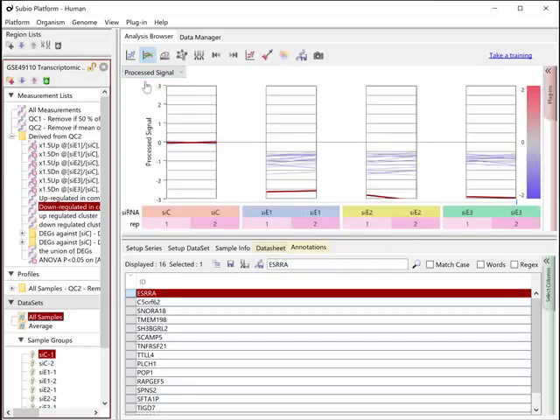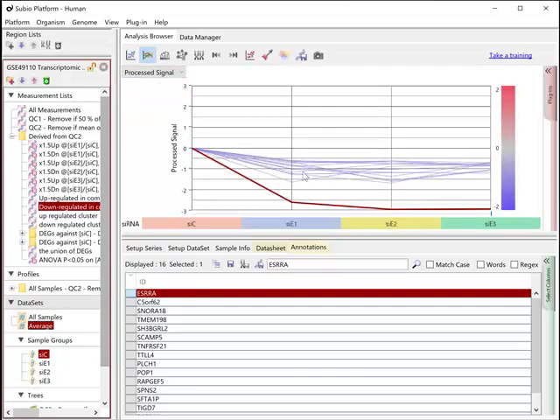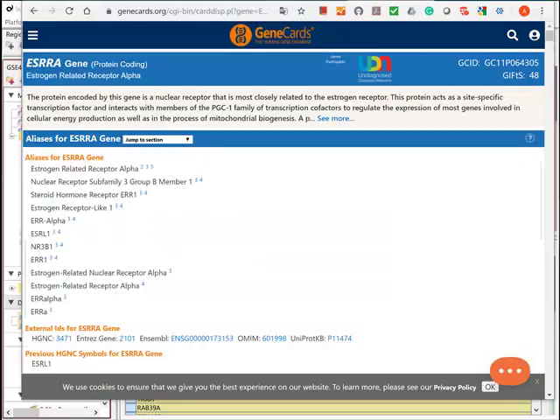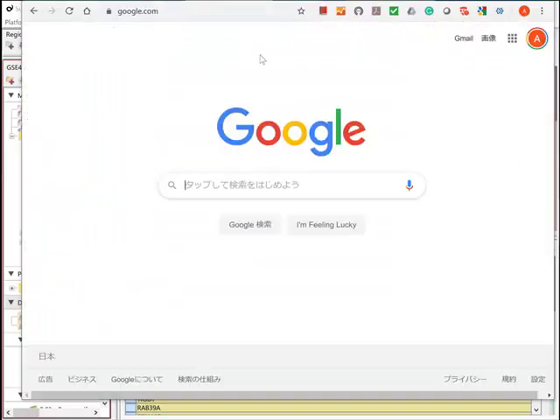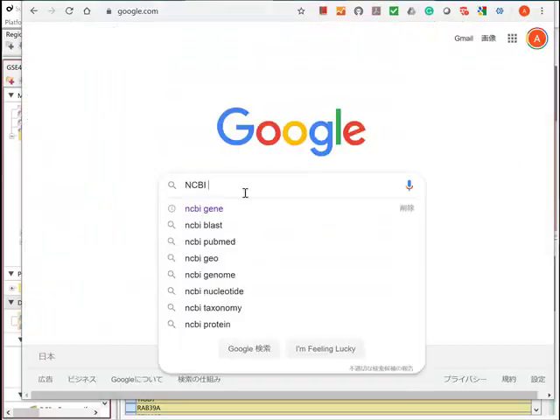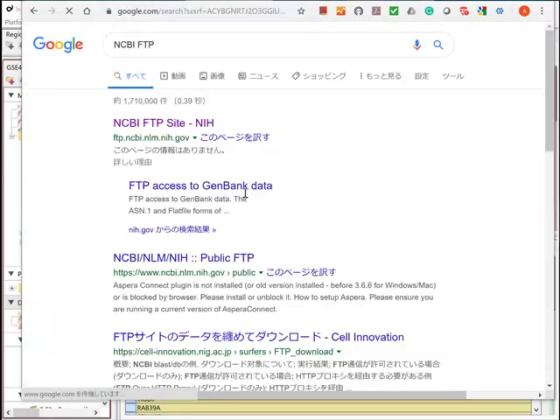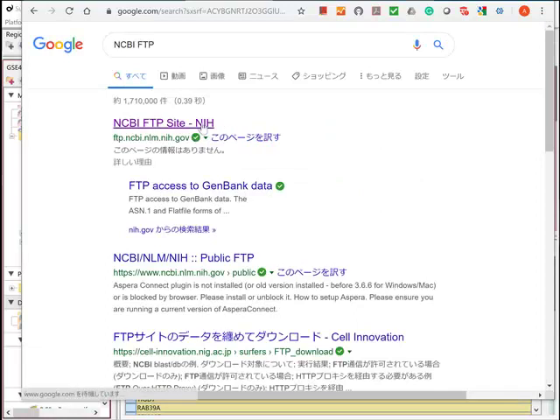You also see the names of the other 15 genes, but maybe you don't know about all of them. So it is helpful to make the data with the annotation of all genes to interpret in the biological context.